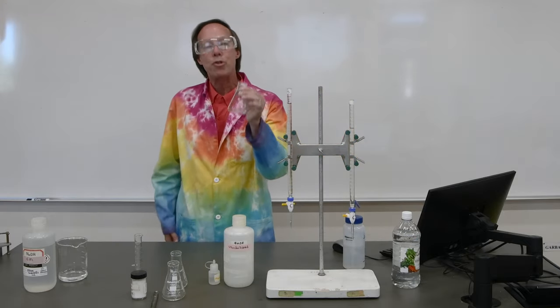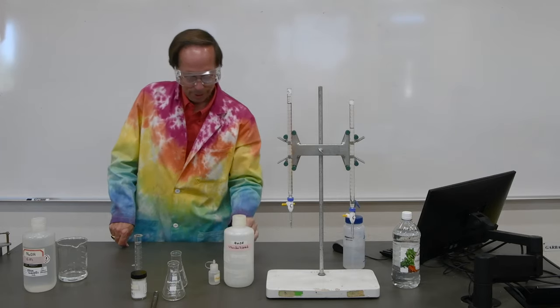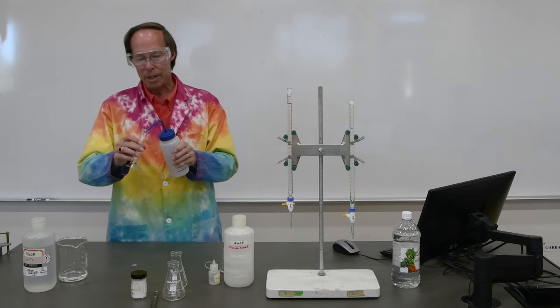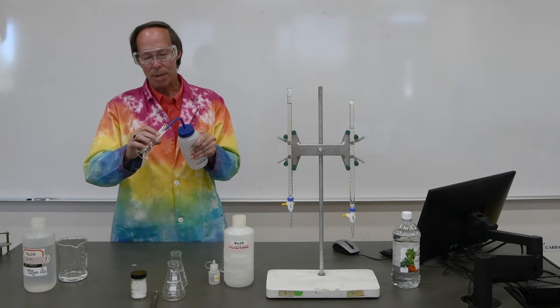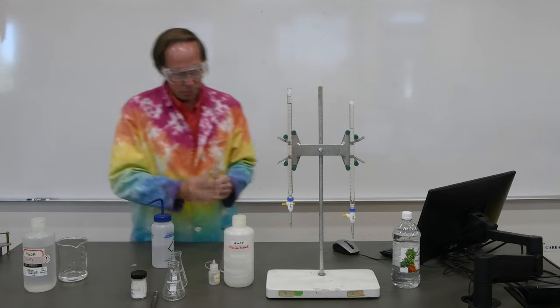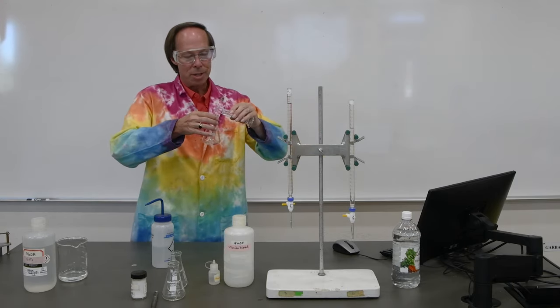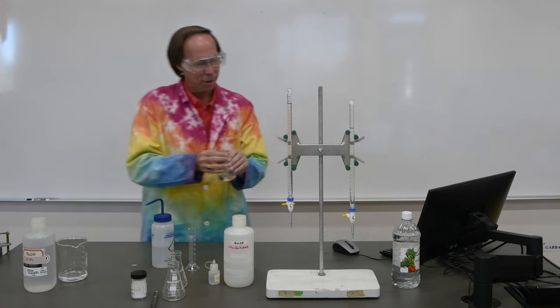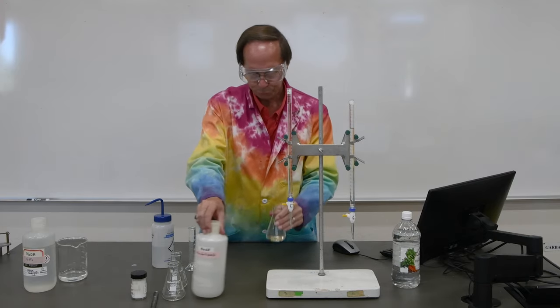Now I'm going to make a small change to the procedure in the lab book because this is very little sample. So as we did with the water hardness lab, I'm going to add some deionized water to this just to give it a little more volume so it's easier for us to see what's happening. And just as in that lab, adding deionized water will have no effect on our results because there's no hydrogen ions in deionized water. It is not going to change the amount of vinegar in the flask. So now we've got a sample a little easier to see here.